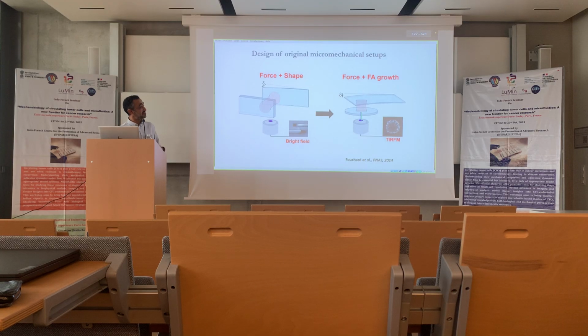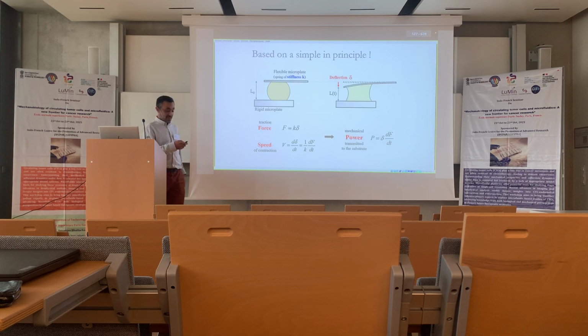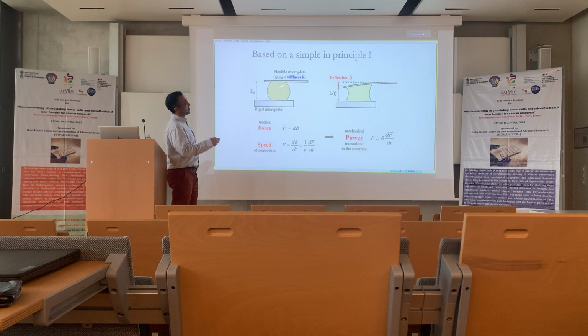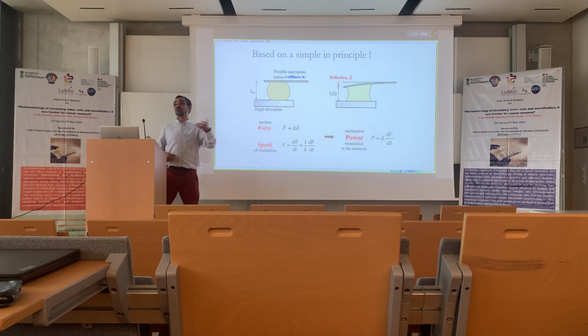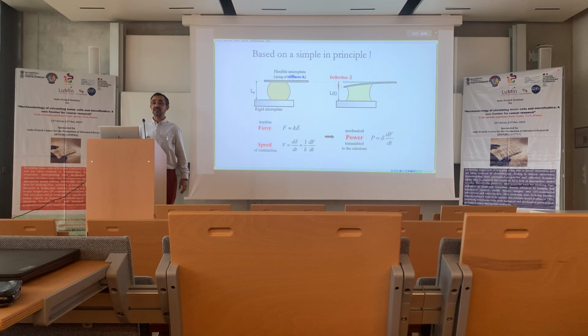And when I say mechanics, it's in fact very simple. You have one cantilever that's rigid, and the other is just a spring, in fact. So you can make very basic uniaxial measurements, and force, of course, from deflection. You can also get the speed, we won't talk about it, but you can get the mechanical power, so you can even measure the energy the cell is spending to do some work.